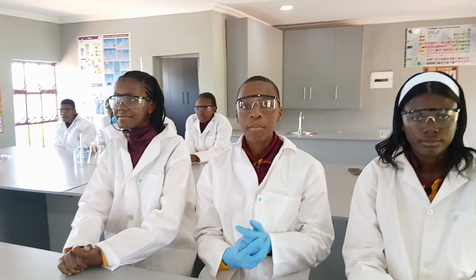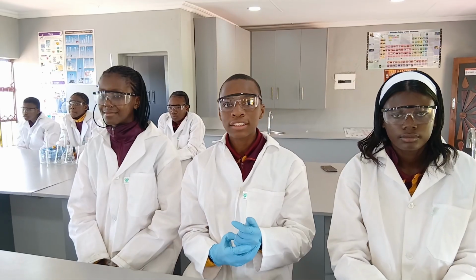You all, standing before you is Shaka Kando, and I am a member of Bright Star High School Science Club. Today we're going to be testing if certain household substances are acids or bases.